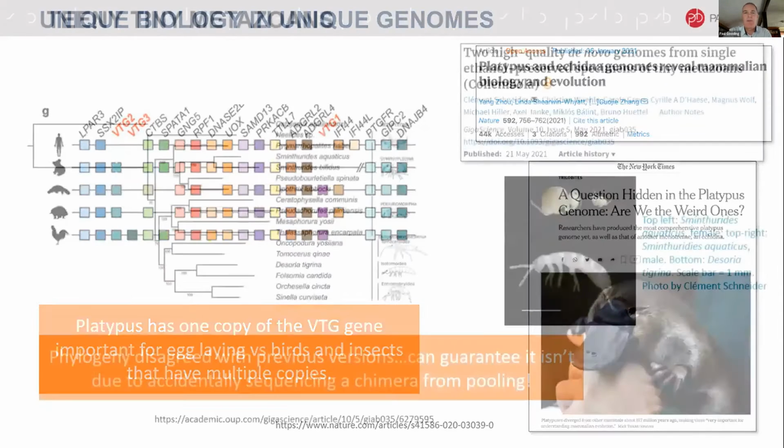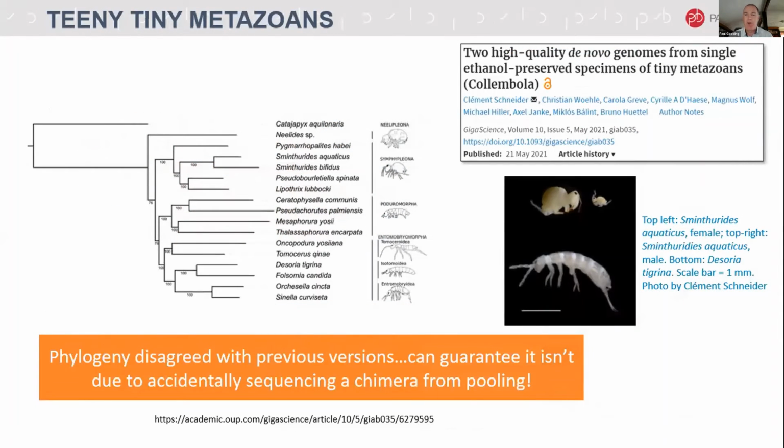And just finally, just to say, obviously you need DNA in order to be able to do this. So until very recently, it was limited by the amount of sample you could get. But now we're sequencing such things as these little metazoans, these little springtails that are shown here. There is an ultra low DNA input method now to go into making PacBio libraries. It does involve some amplification, which none of their other protocols do, but it can be done.